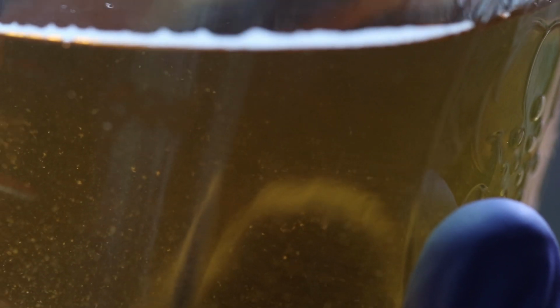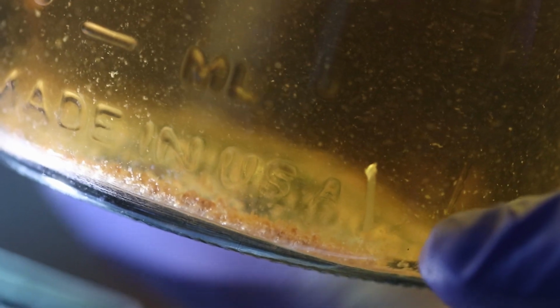We depress it, and then I'm aiming for the corner of the jar, and I'm backlighting it so I can see that the biopsy has landed in there. If I don't see the biopsy, I go ahead and do this all over again. But now that we see the biopsy, we know that the jar is inoculated. That's all it takes, is a tiny little piece of tissue.